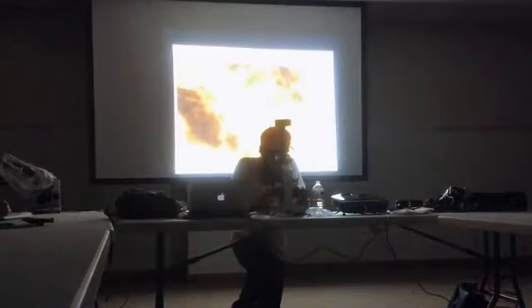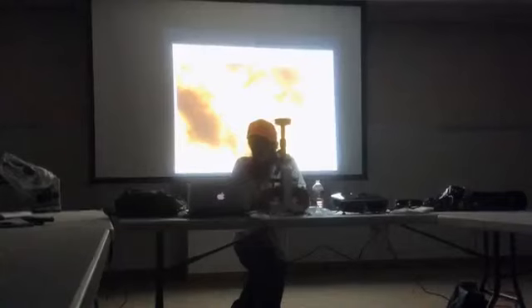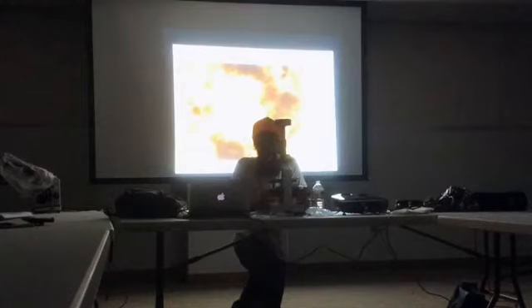I'll go to one last random spot, and then, so I'm tracing this fungus or whatever it is, and if that is a fungus, it's definitely not a good one because it's so skinny and thin. I'm tracing through to see it. Sometimes you have to change how you're focusing to see what's in every slide.